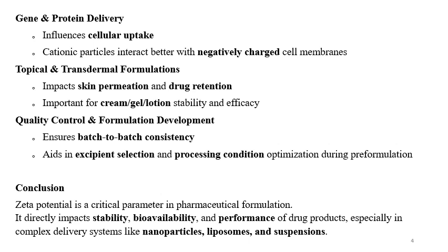Zeta potential has an important role in the pharmaceutical field and it is related to the formulation stability, bioavailability and performance of drug products. Especially it is important in the complex formulations and drug delivery systems like nanoparticles, liposomes and suspensions.